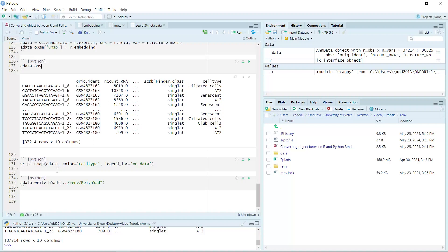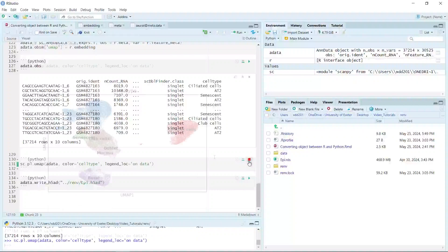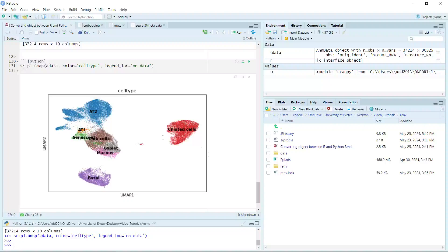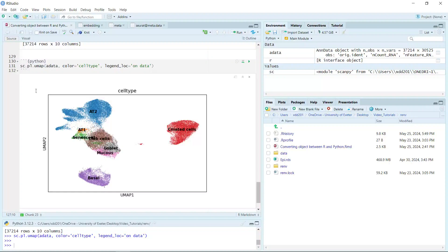Now we can use the scanpy pl.umap function to create a UMAP for the AnnData object. You can see we created the UMAP for the AnnData object, and the cell clusters look the same as the Seurat UMAP. The colors are different for each cell cluster compared to the Seurat UMAP, but if you want to make the same colors, you can set the colors in the UMAP plot function.